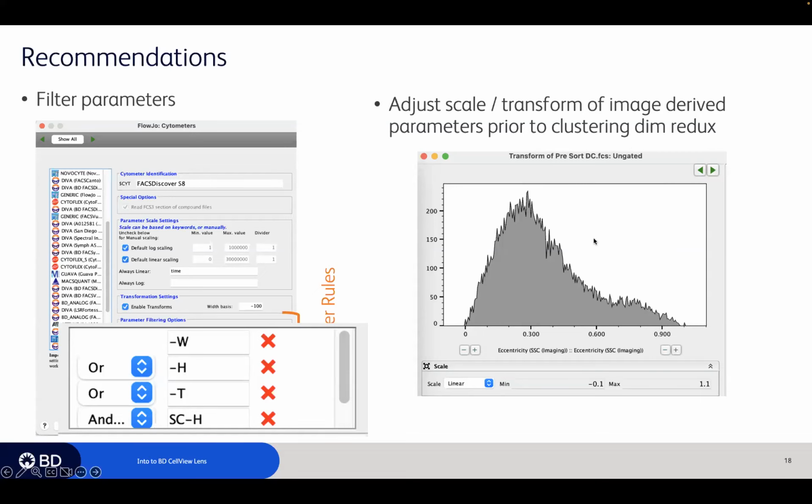I do have just the cursor I'm using on my scene, Cecilia. I'm hoping to describe most of what I'm talking about in words, and I don't think I've used the cursor very much, so that might be why you're not seeing a lot of pointer. At this point, I'm just talking about the right side of the screen.